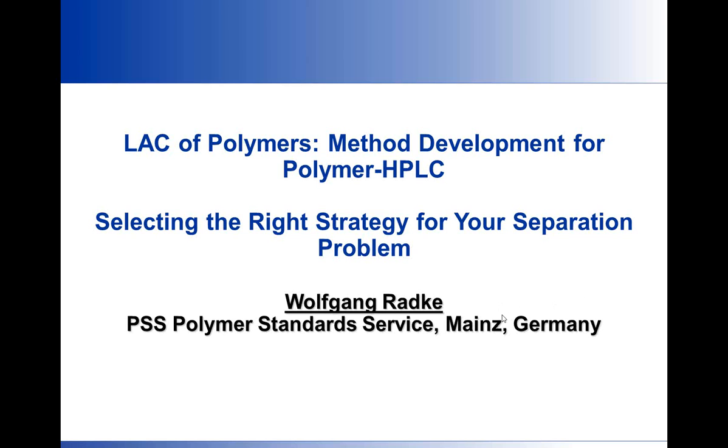Today I would like to give you a short introduction about interaction chromatography of polymers and how to select the right strategy for your separation problem.